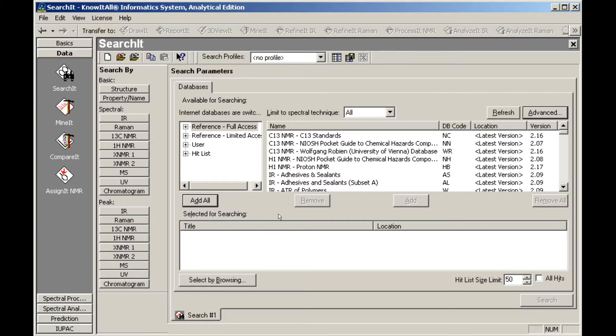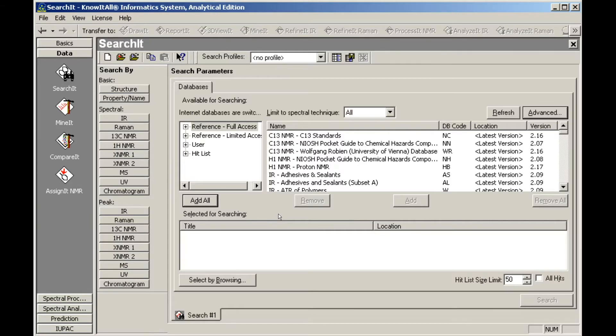We will perform a structure search using several of the mass spec databases. We begin by limiting the database display to the spectral technique we are interested in.